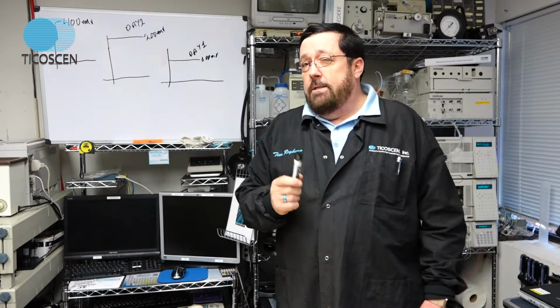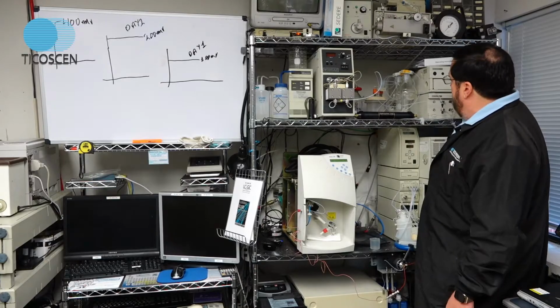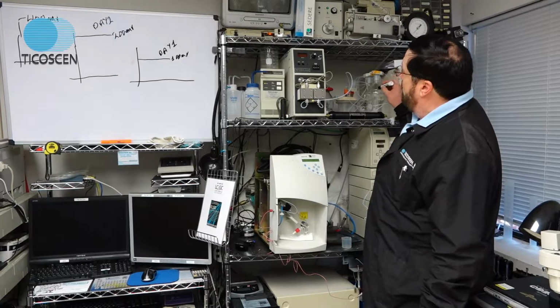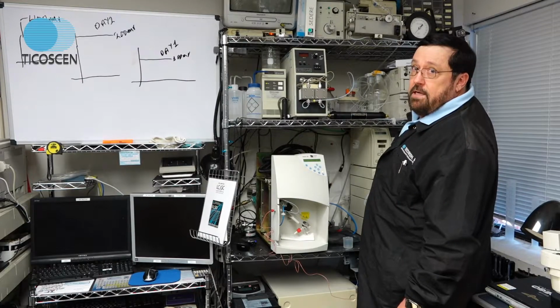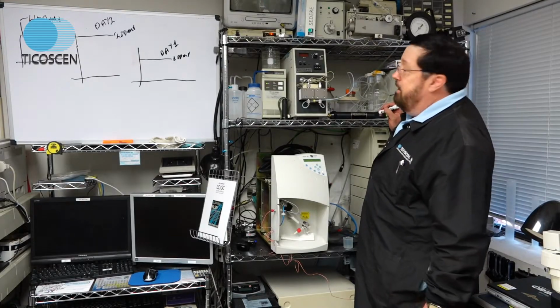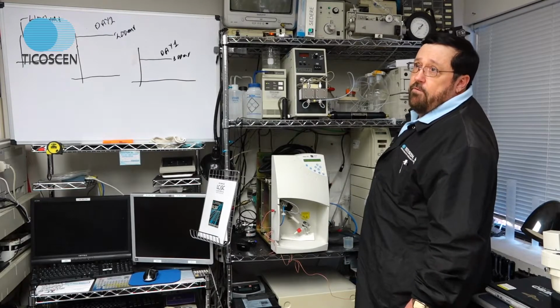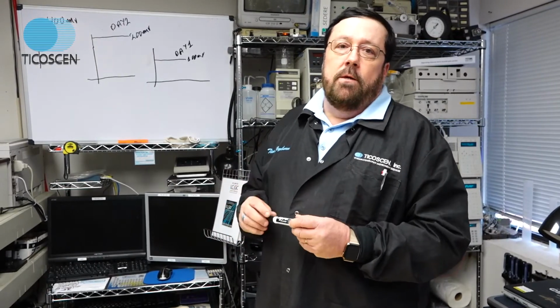And even if you change the water daily in your bottle, you still have a degasser. Your solvent degasser right here has about 15 ml of dead volume inside. So if your water becomes contaminated and you change the water bottle, you're still going to have contamination inside the degasser. So even though you change the water bottle, once the system is contaminated, you're going to need to sterilize your HPLC channel. You're going to need to run acetonitrile or alcohol through that for about half an hour and sterilize that whole water line. That water channel needs to be sterilized. Then go back to fresh water. That is what you need to do if you run into old water.